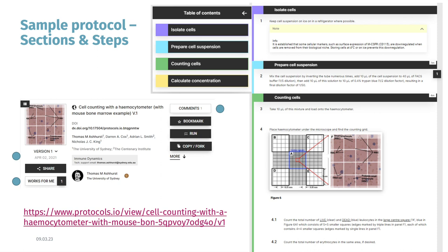You also see what version of the protocol you're using, and feedback can be given by any registered user with just one click — saying 'works for me', or of course you can give more detailed comments. You can bookmark a protocol you find so you can locate it again easily later, and you can run it, copy it, or fork it.